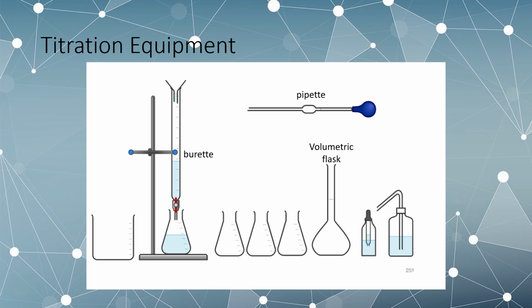For those of you who are exploring titrations for the first time, it can also be the first time you explore some different equipment within the lab. Now, hopefully by this point you're familiar with your beakers and different sizes and shapes and all that sort of stuff, but there are three key parts that most people use for the first time during a titration.